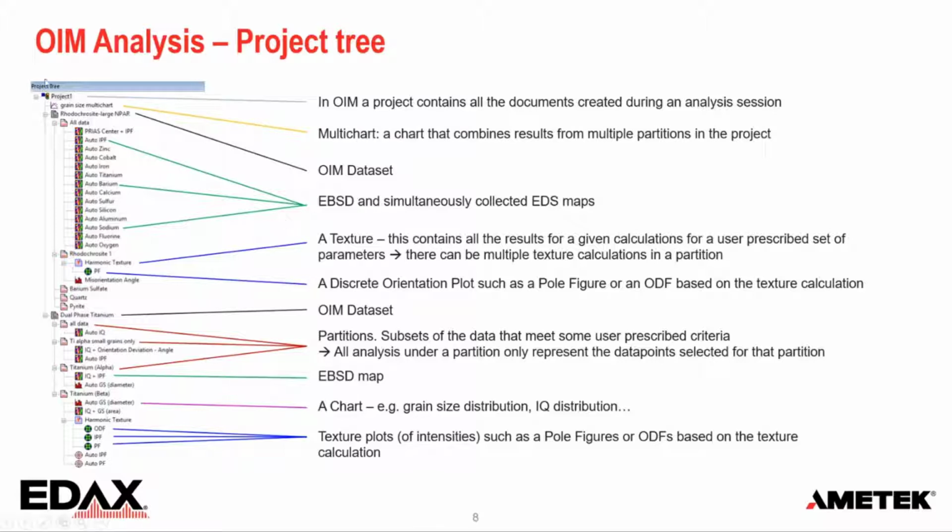Then finally, here at the top, there are multi-charts, and that's a chart where we can actually combine and compare data from different partitions. Otherwise, when I make it in a partition, I would only use that data, but with a multi-chart, I can merge data from different data sets or different partitions.